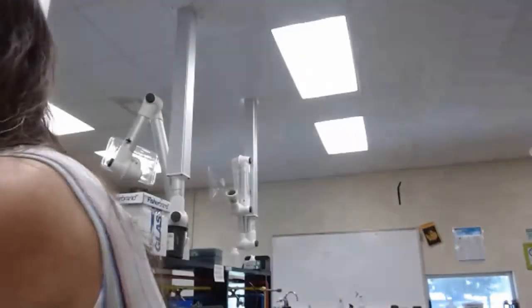So in my hand, I have two rulers. I have two 100 milliliter beakers. I have one 100 milliliter graduated cylinder. Each of these facts is composed of a number that has a meaning, and each of these numbers represents an exact quantity. Things that you can count are exact.